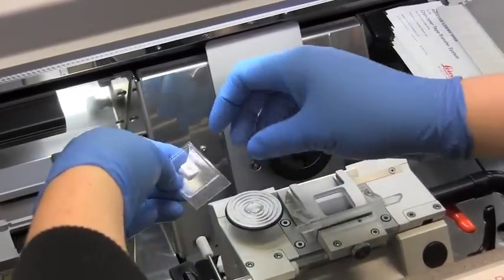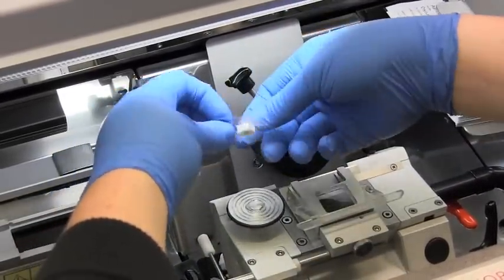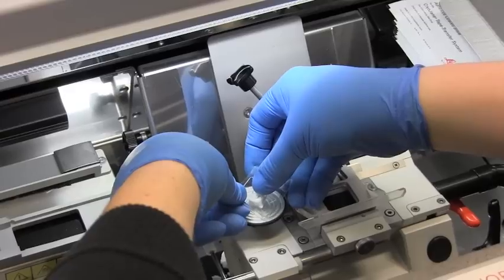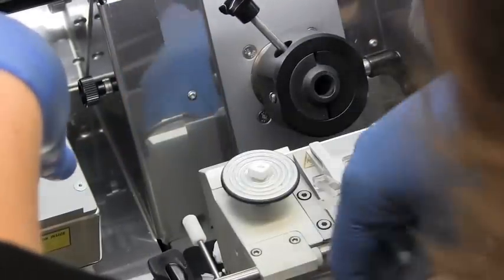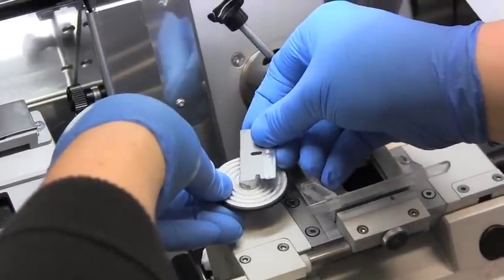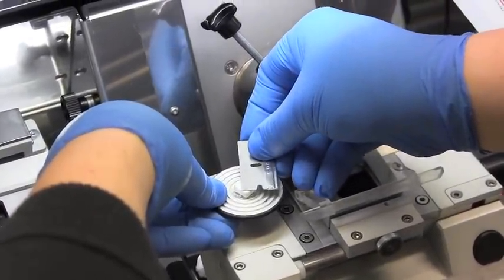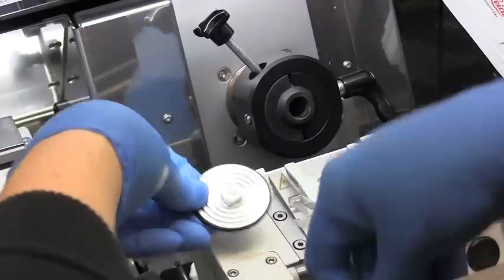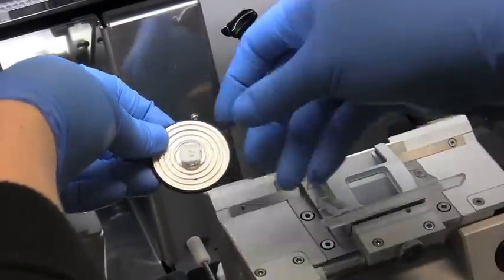So as it pops out, this is the side that's going to go down onto the chuck. And then use your tweezers or a razor blade to press it down. You can see your sample mounted in there.